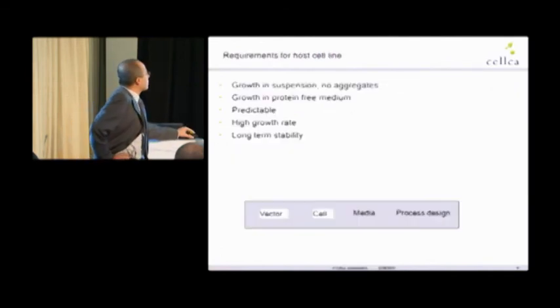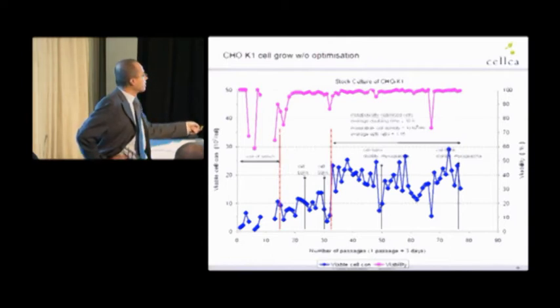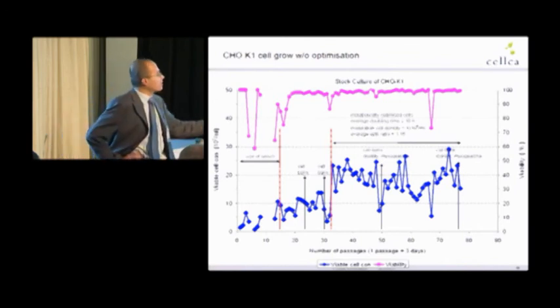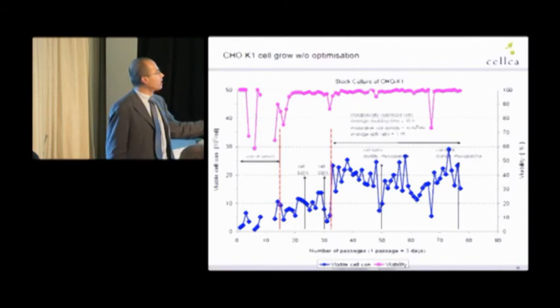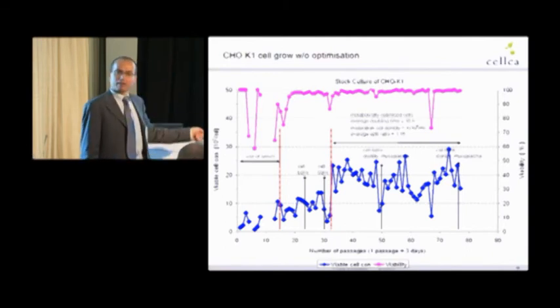Secondly, now I go back. Long-term stability. I mean, the cell line is more or less adapted here to serum-free conditions. From there, the cell line doesn't grow in serum. But if we take a cell line from here for inoculation of a production bioreactor and take another aliquot of inoculum from there, and inoculate the production bioreactor, is this cell line still the same as there?